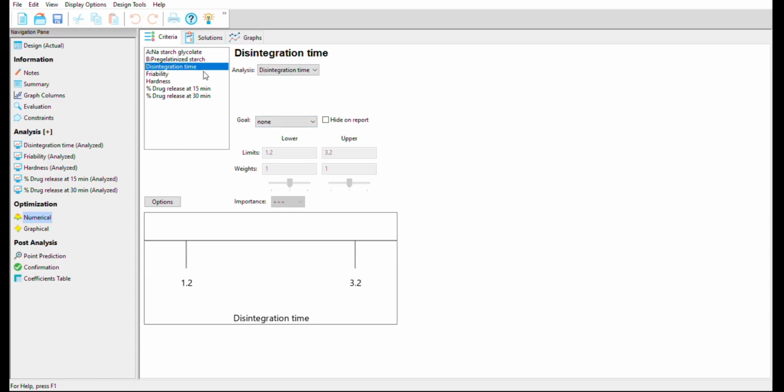Then disintegration time. So let's see, what should our disintegration time be, high or low? We always know that as it is our immediate release dosage form, obviously its disintegration should be increased. And if disintegration is increased, then its disintegration time should be minimized. Okay, if we minimize our disintegration time, obviously then we will have our fast disintegration, so it is minimized. Then friability, so let's say whether we want friability more or high. Obviously we want less friability, because friability is the tendency of tablet breakage. Okay, so it should be minimized.